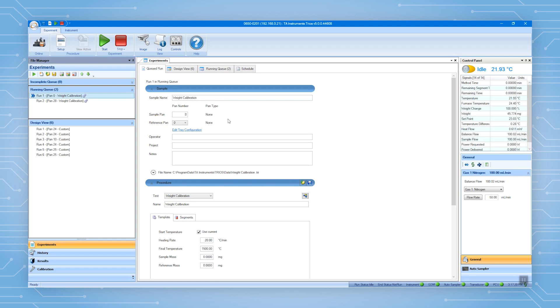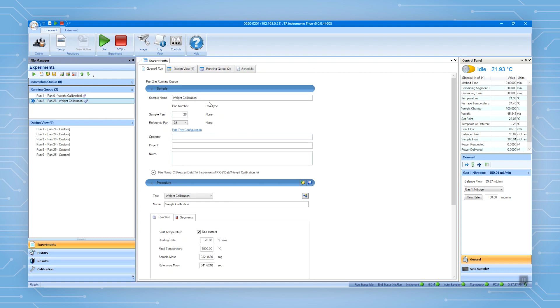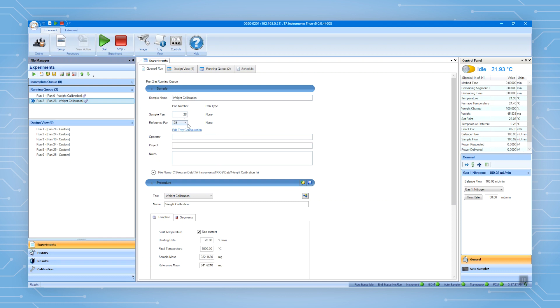Here you can double-check all the information you just entered. This calibration includes two runs. The first run does not use the two calibration weights and the second run does. If everything looks good, click Start.